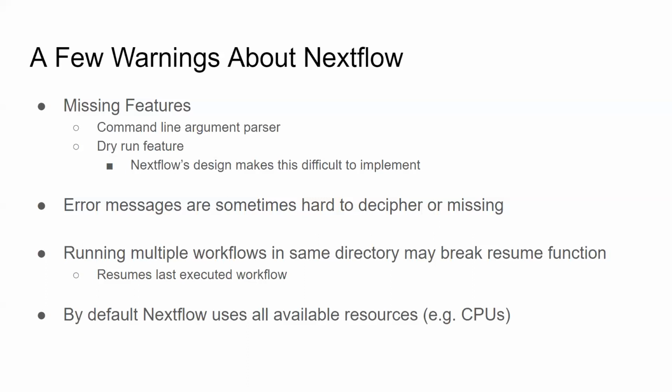So, for example, if you ran Bactopia, then you ran a Bactopia tool, but you're like, oh crap, I messed up something in Bactopia, let me resume that real quick. You may have just broken it because the two Nextflow workflows kind of overwrite the cache of each other.